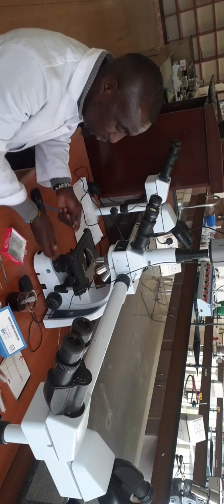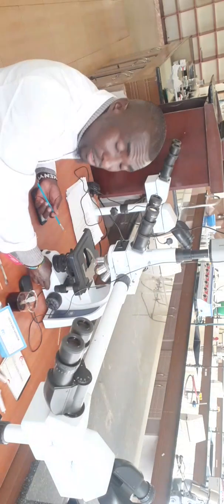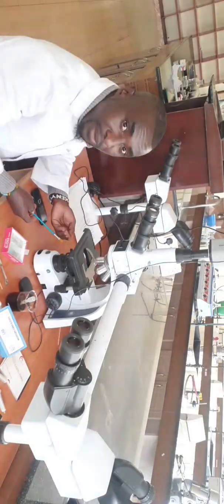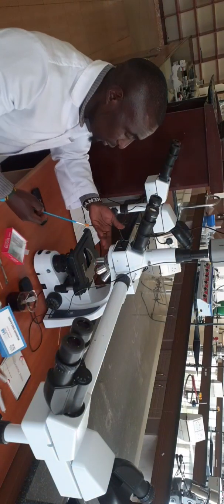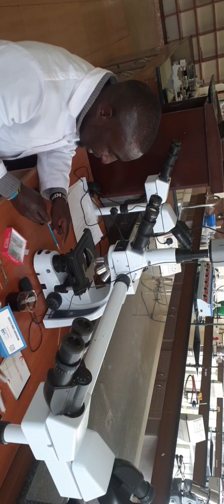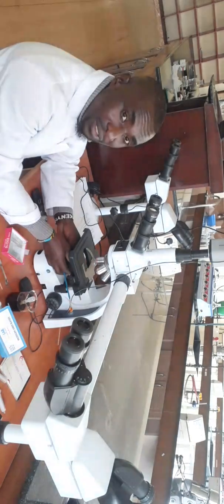Then we have got the illuminator. This is the illuminator, where there is the source of light. When you switch the button on, the light will pass through the illuminator to the other apertures. That is the diaphragm, and up to that we are targeting the specimen on the stage. So this is the base, illuminator. This part is called the diaphragm. This is the diaphragm.